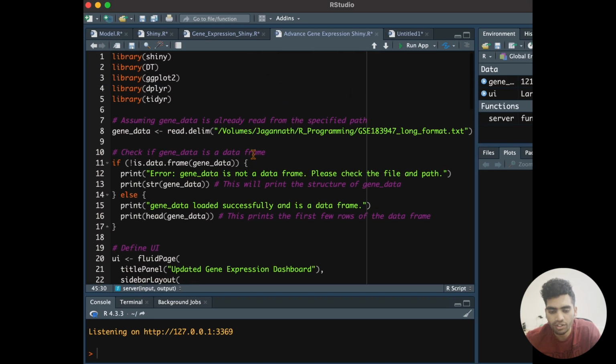And that's it. If you are interested in more dashboards, I would like to create more. I'm working on an NLP project. The model will predict the gene region and non-gene region. I want to put that in a shiny app, and then users can enter a sequence and find out whether it's a gene region or a non-gene region. So that's the basic idea I'm working on.